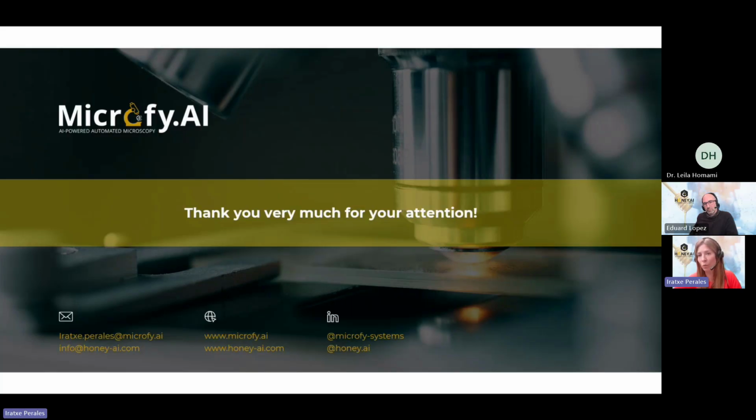And as I said, when the percentage of unknown pollen grains is above 14%, there is a warning message that says, this is a suspicious sample, send it to the lab. This is the reason, because the percentage of unknown is too high for us. We don't tell you that it's from China. We just tell you that with the global model, there is a significant percentage of unknown pollen species.